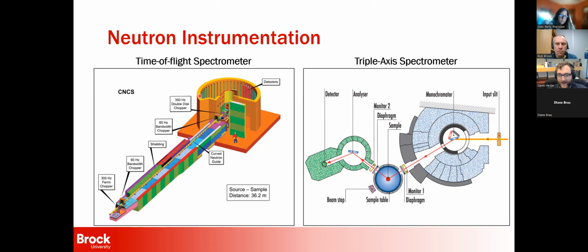And in reality, almost all of them will not interact with your sample at all. But if you have enough, it will occur often enough that they will bounce off your sample at some angle and hit one of these green detector rods, which are filled with helium-3. And you then detect the neutron.